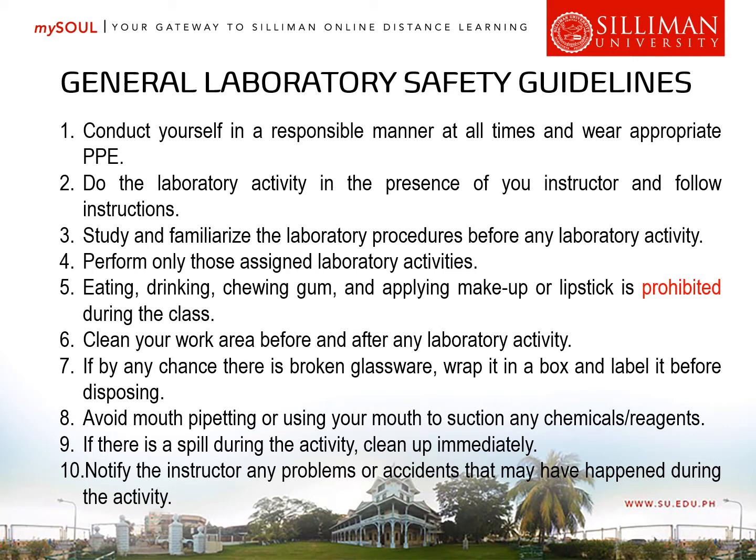Number five, eating, drinking, chewing gum, and applying makeup or lipstick are prohibited during the class or during the activity. Okay, so this is self-explanatory. Number six, clean your working area before and after any laboratory activity. This is a protocol every time there are laboratory procedures to be done.